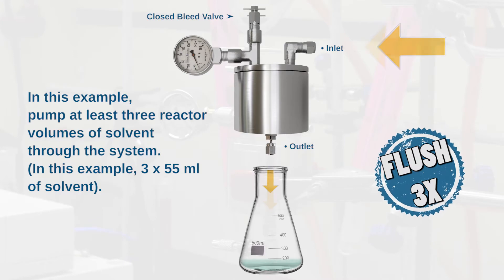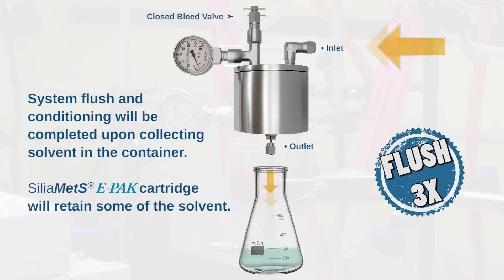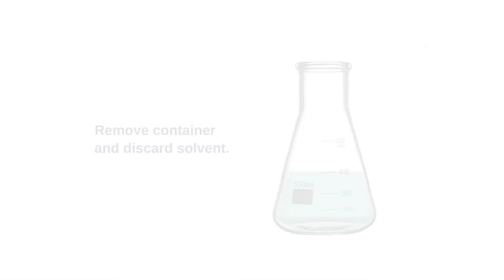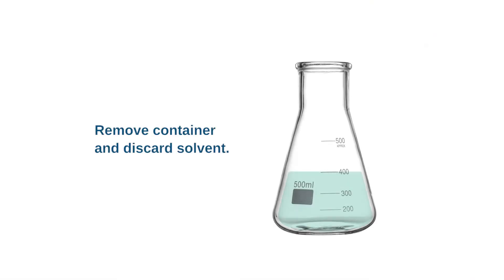In this example, pump at least three actor volumes of solvent through the system. System flush and conditioning will be completed upon collecting solvent in the container. SiliaMet E-PAK cartridge will retain some of the solvent. Remove container and discard solvent.